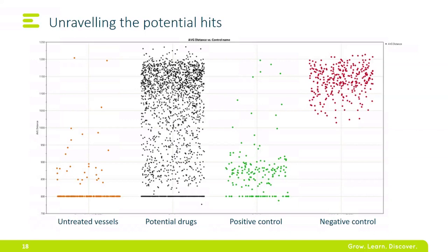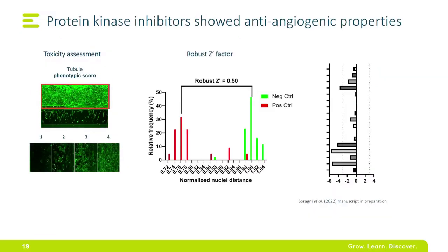So you know, what does this data mean, right? The experiment here is actually the easy part. But then understanding what you're doing is really the bulk of the work. I already explained to you that there's both the efficacy data and the toxicity data. So the toxicity data helps already a lot with discarding a lot of these data points as being not so useful. This is actually another picture showing that we had a very beautiful robust Z factor and a very good window.